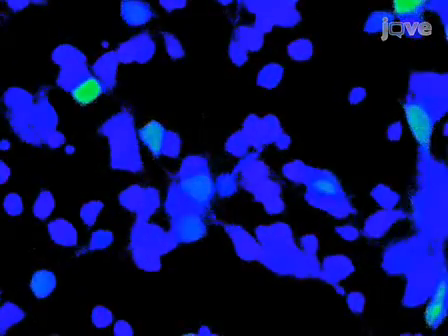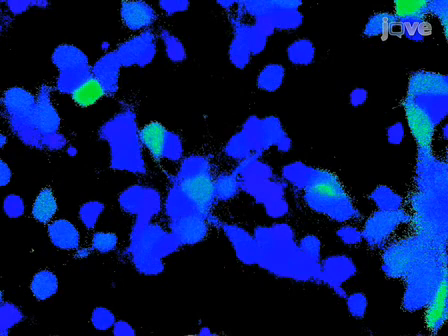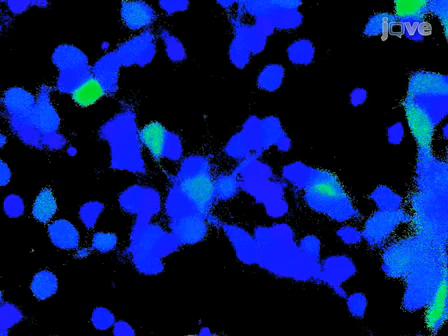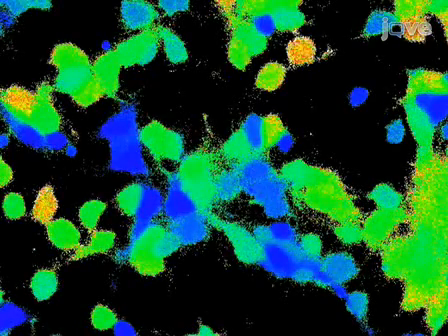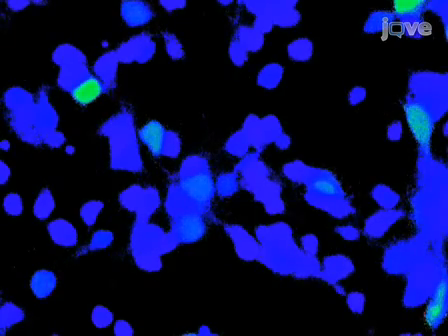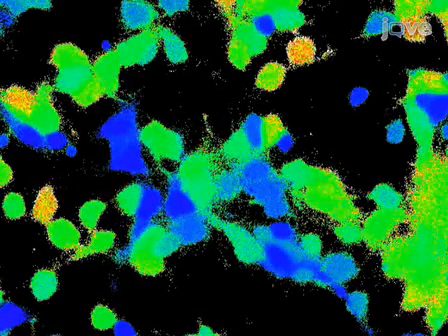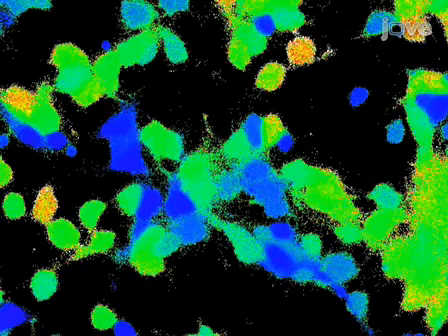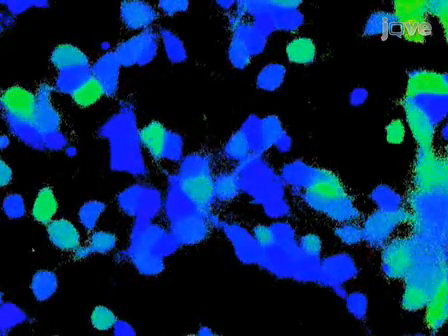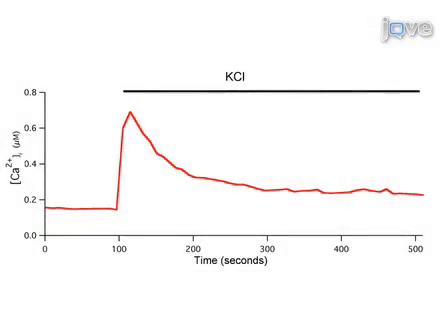This is a calcium imaging movie of FURA-2-loaded neurons stimulated with potassium chloride. The image is pseudo-colored so that low FURA-2 ratios, which correspond to low calcium concentrations, are blue, and high ratios, which correspond to high calcium concentrations, are yellow and red. Upon depolarization with potassium chloride, which opens voltage-gated calcium channels, calcium rises and the FURA-2 340 to 380 excitation ratio increases, causing the neurons to become yellow and red. The calcium is then removed from the cytoplasm, which causes the cells to become blue again. These images were analyzed and the ratio values were converted to calcium concentrations using a simple equation and the program Igor Pro.